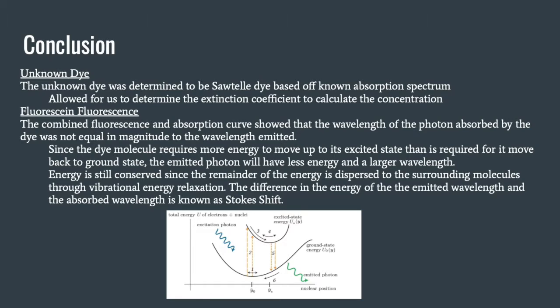We determined our dye to be sawtelle dye based off the known absorbance spectrum. Comparing the spectrum also let us find the extinction coefficient to calculate our concentration.